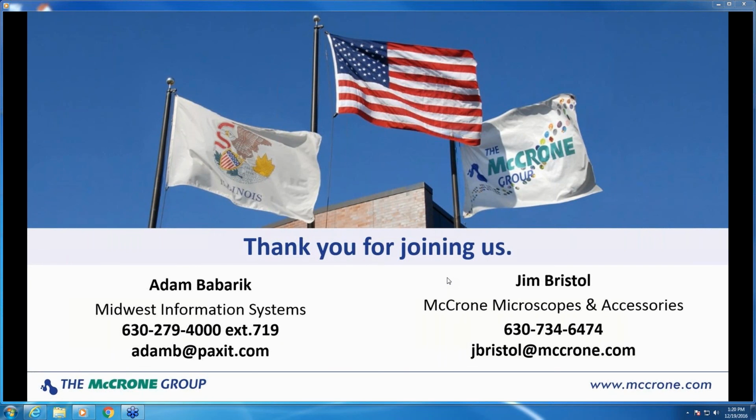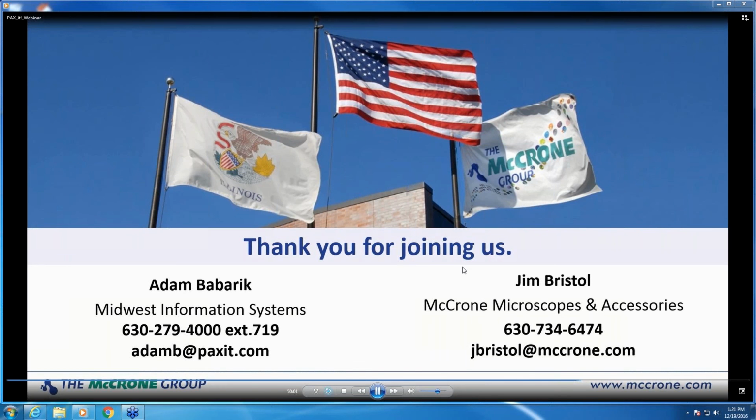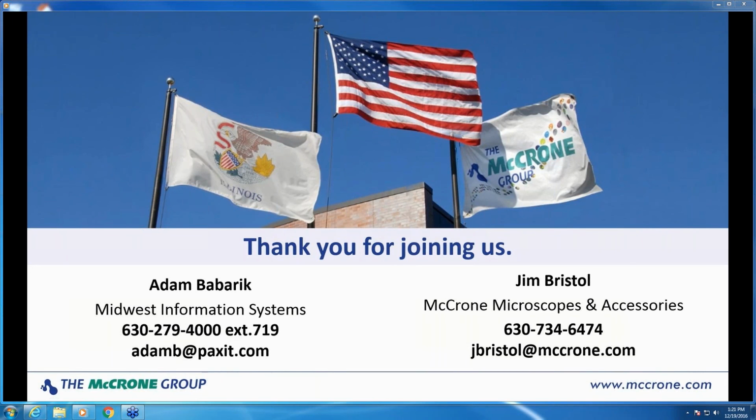To review that, existing microscopes, we often retrofit our PAXcam to existing microscope equipment. It's very common, and PAXit has always worked with third-party cameras.